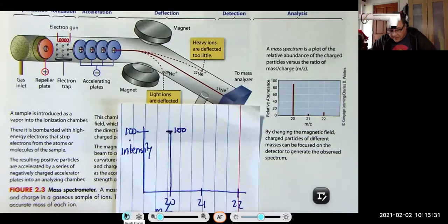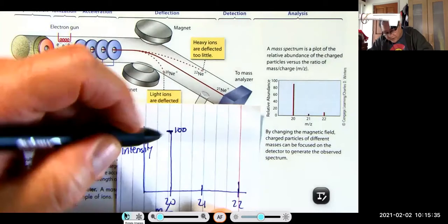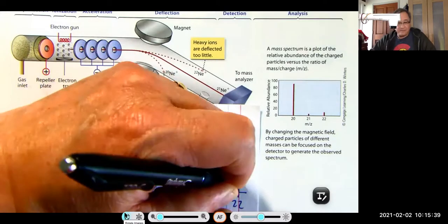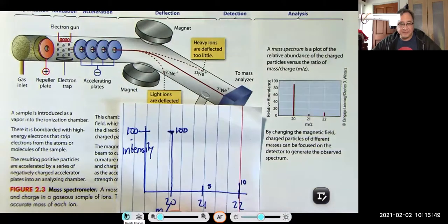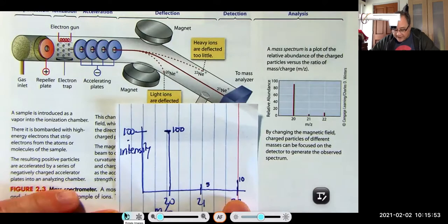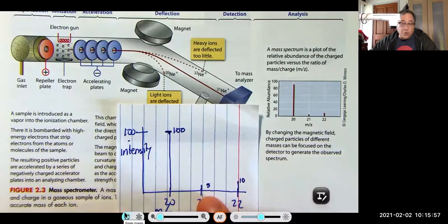And then the other peaks are drawn relative to that 100. So you might have 100, 5, and 10. Now notice these numbers don't add up to 100% because they don't represent 100%. 100 just means that that is the biggest peak. And this means that this is 1/10 the size of the biggest peak. And this is 1/20th the size of the biggest peak.